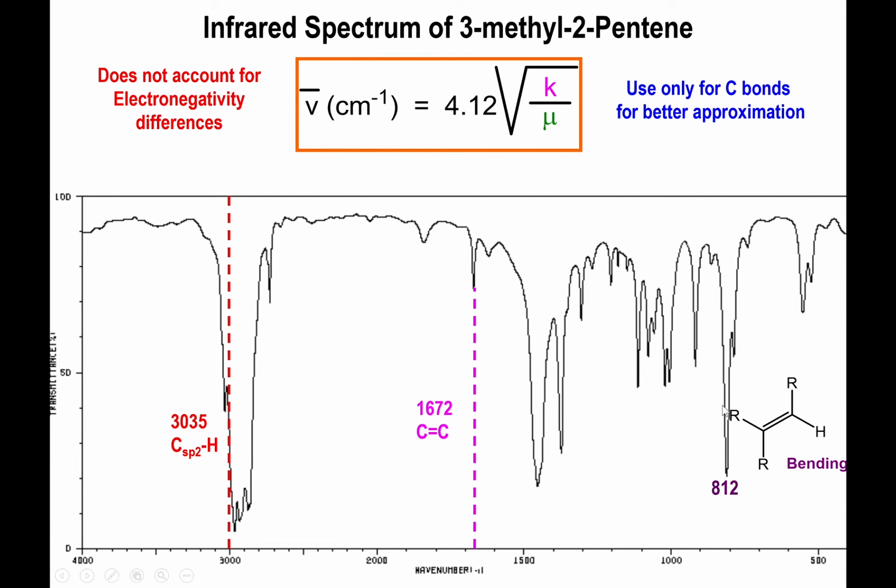And this has to do with the fact that now we're putting a lot more alkyl groups around it. This has become a lot more symmetrical than it was before. The peak in the fingerprint region is showing up at 800. Right? It's showing us kind of an intermediate case in terms of the intensity.